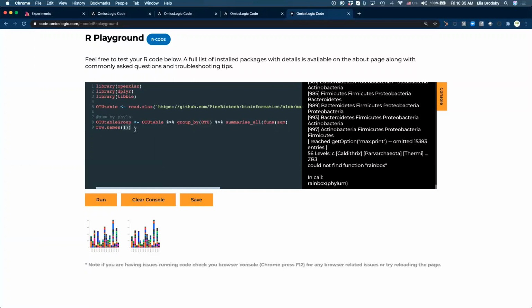Okay, so row names, we're going to add to OTU table group. And we will make that OTU table group OTU.